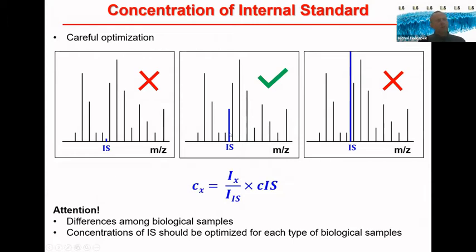We try to keep this concentration somewhere within 1/3 to 2/3 of the intensity of the most abundant lipid species within the class to have the most reliable quantitation. And for this reason, we prepare these mixtures by ourselves, then we aliquot them and use them over the whole year for quantitation within my group, which is, by the way, also slightly cheaper compared to these pre-mixed internal standards in SPLASH mix.